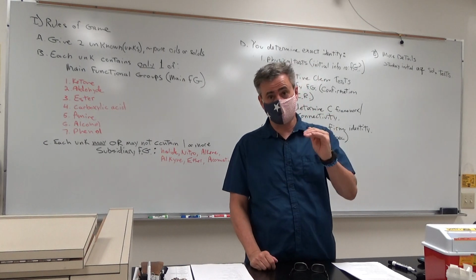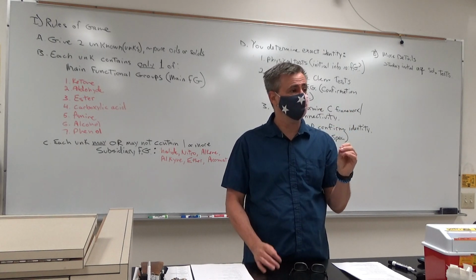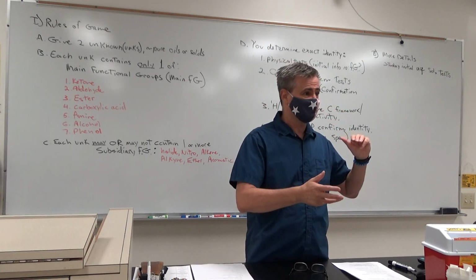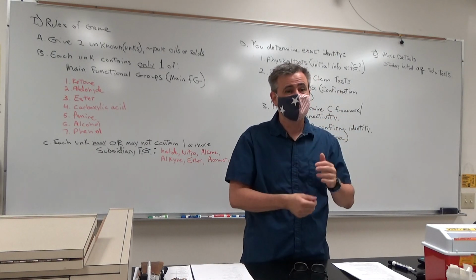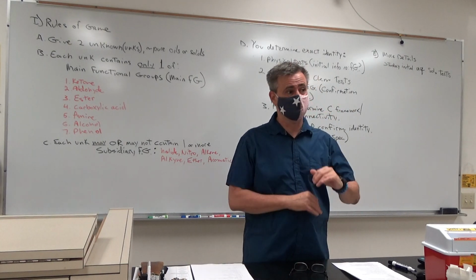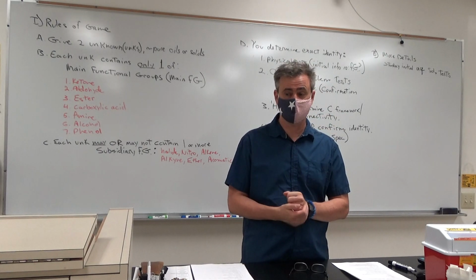If you get to that point, remember, because people forget this all the time: if you see a color change, a precipitation, any sort of reaction, heat given off, a little bit of smoke, you count that as soluble, even if it doesn't dissolve. This is just for sulfuric acid. Does that make sense?